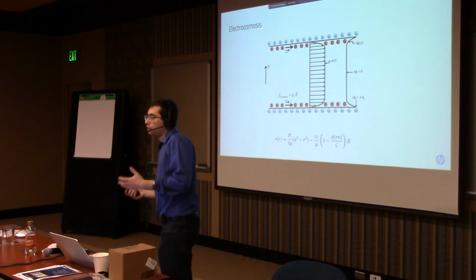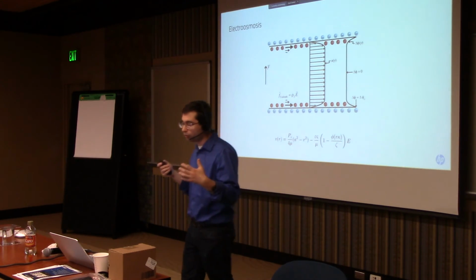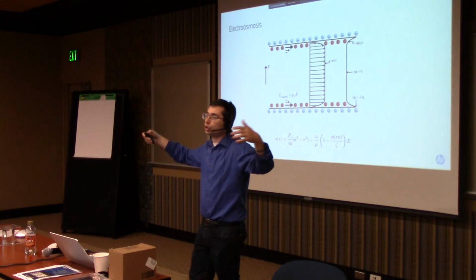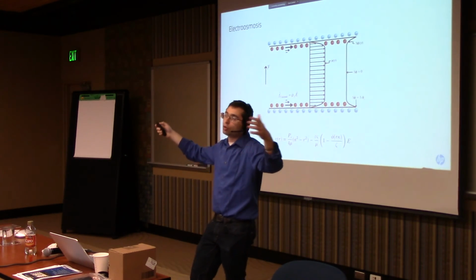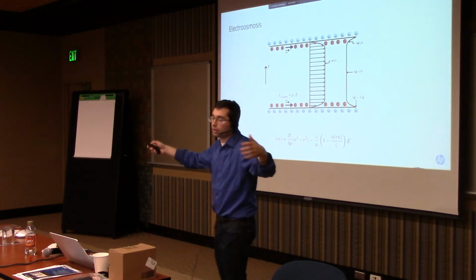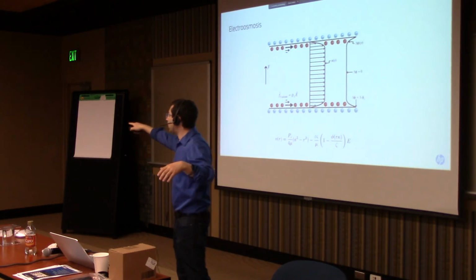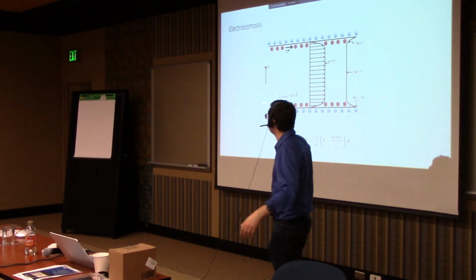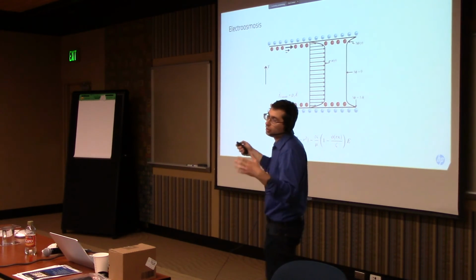The analogy to make this intuitive is if this entire room was a microfluidic channel, like 10 microns, 100 microns, something like that on that size, the paint on that wall would be the thickness of this layer. That's sort of the relative scale.